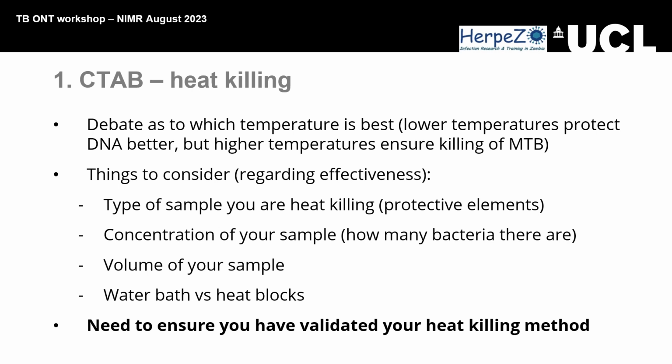The type of sample you're heat killing matters. It depends on whether it's a sputum sample or an isolate from a colony from the culture. For us, we're using the colonies from the cultures. We're not using direct sputum samples. And then the concentration of the sample, how many bacteria are there, and the volume of the sample. After adding the lysis buffer, our starting volume was 400.